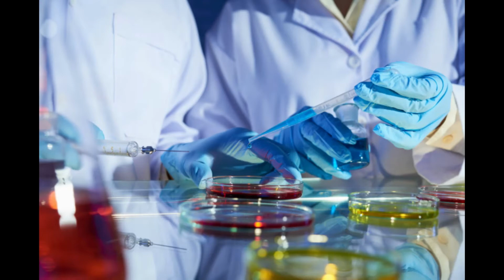We're also going to use the Bunsen burners for this one. So when y'all come in here on Thursday, we'll light the Bunsen burners, and that's what you'll use to flame your stuff as you try to maintain aseptic technique. So let's start with the sterile broth. So let's say I've got maybe a little bigger.